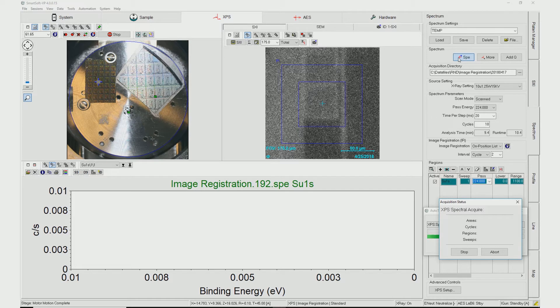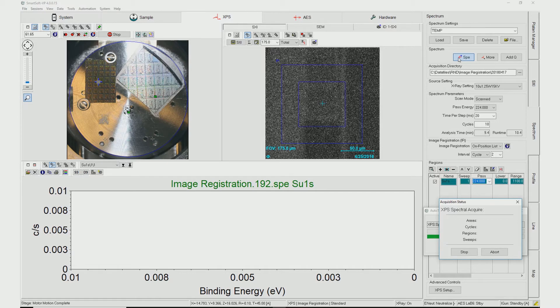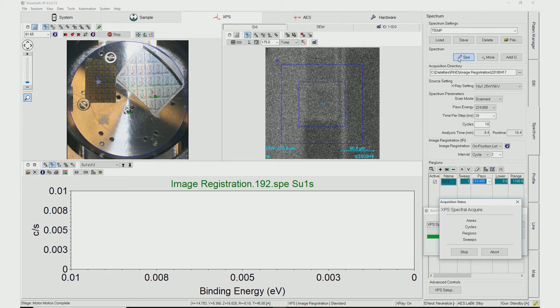Image Registration is performed when the stage reaches the analysis position. The software first generates a new SXI image of the area, which will be compared to the Image Registration reference image. If needed, the position of the X-ray beam will adjust. A second SXI image confirming the correct position will appear, and spectral acquisition of the first queued point will automatically begin.